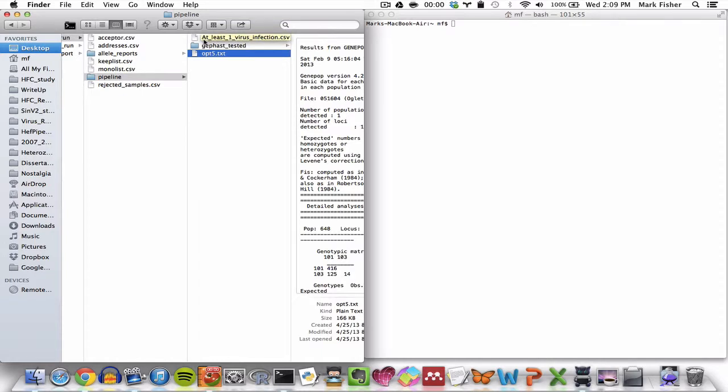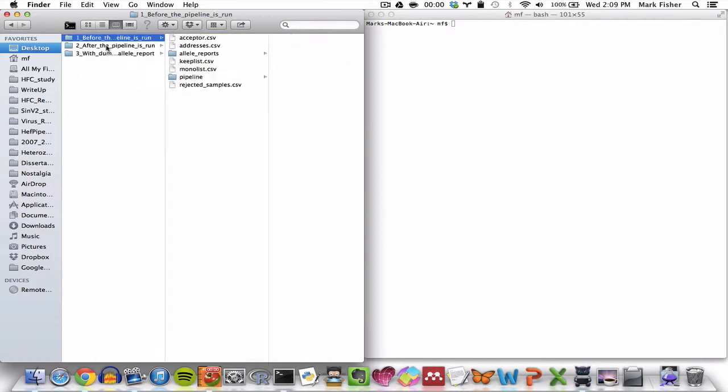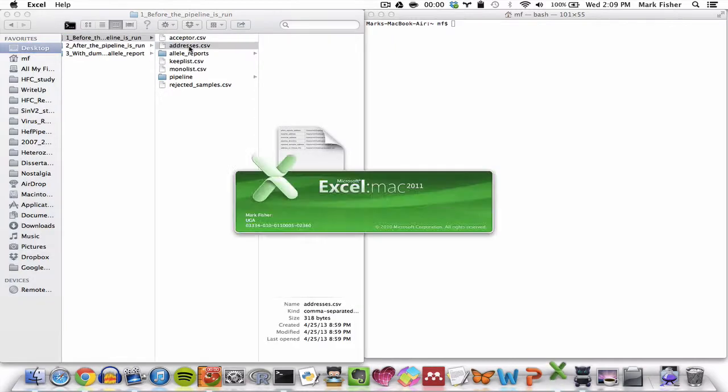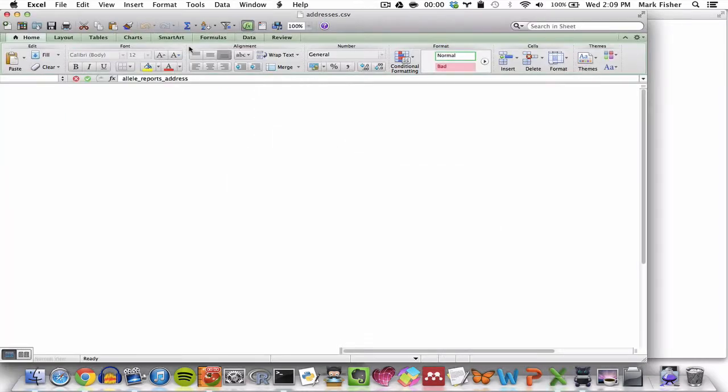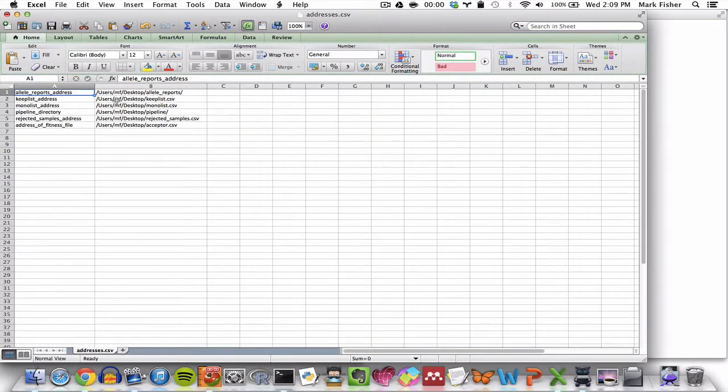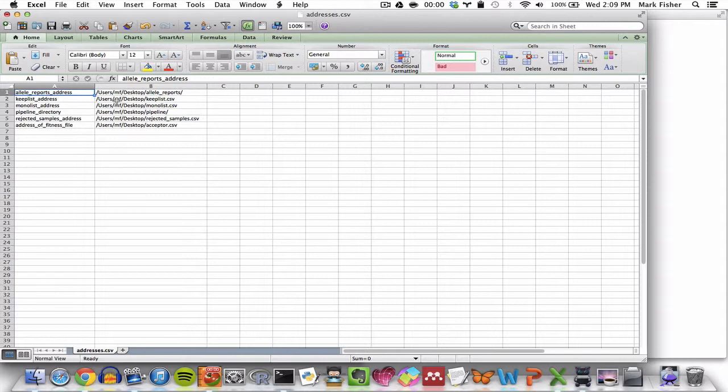So let's begin with this directory, the before the pipeline is run directory. We'll open the addresses file, right here, and we'll place the example files that are referenced in here in the locations that we want on our computer. And then we'll update the paths in column B to reflect where we've put these files.